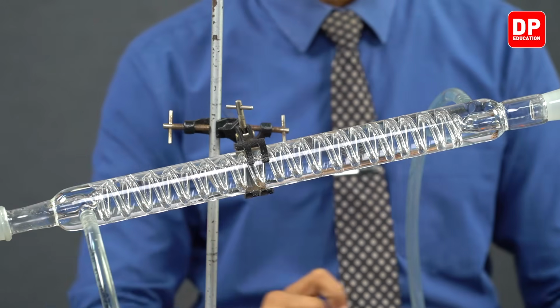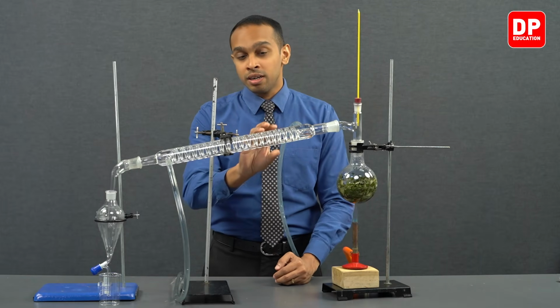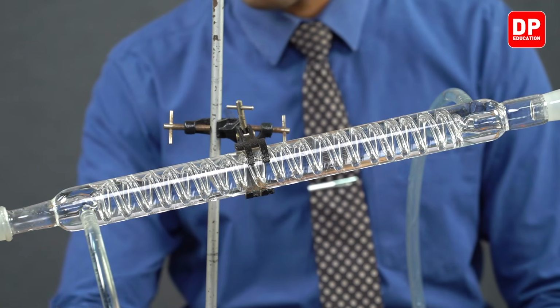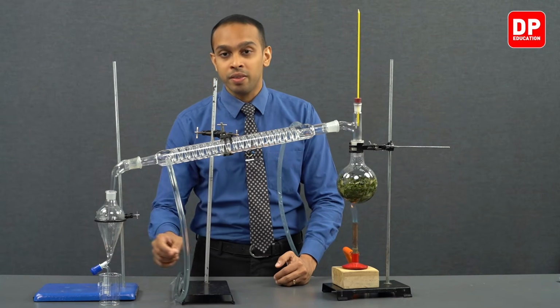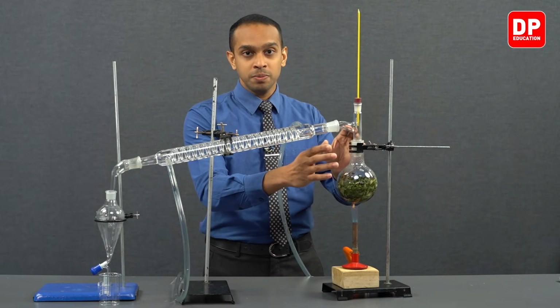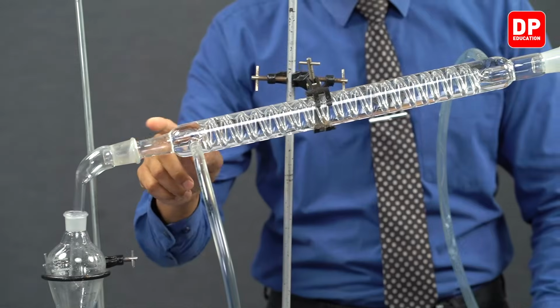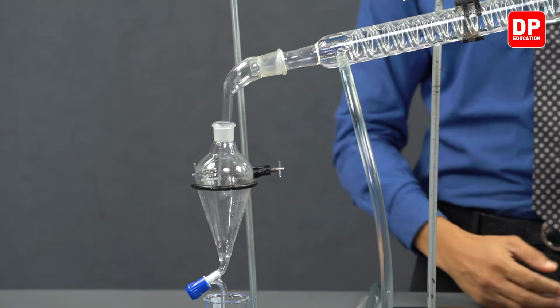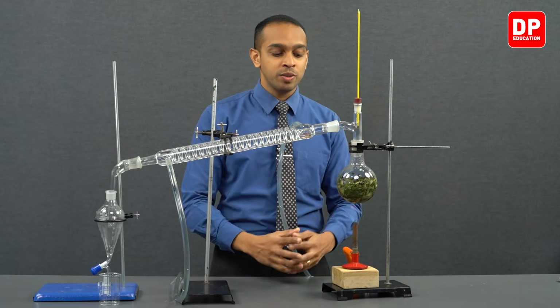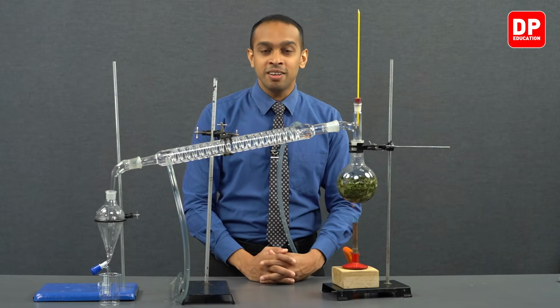So we will continue to heat this, and you can see when the liquid is getting formed and as the gas is cooled down, you can observe a liquid getting collected at the separatory funnel we have over here. So the vapor that is produced will enter the condenser and it will cool down, will produce a liquid, and that liquid will get collected in the separatory funnel. So we'll allow this setup to get heated up for a while, and then let's come back to it when it is producing a vapor.